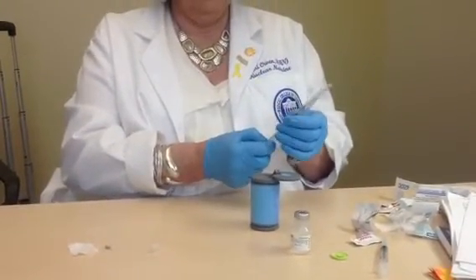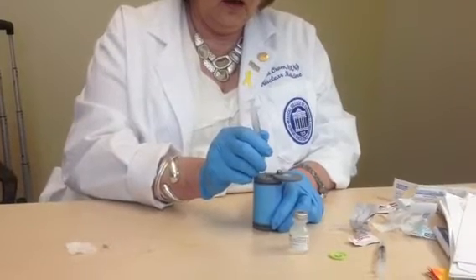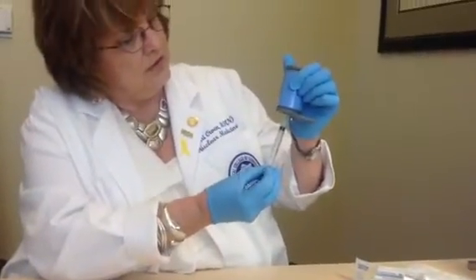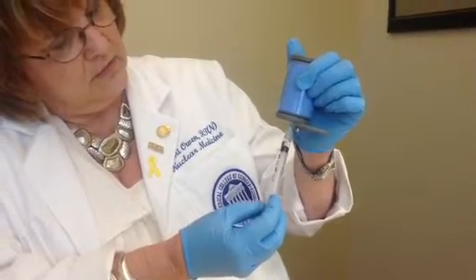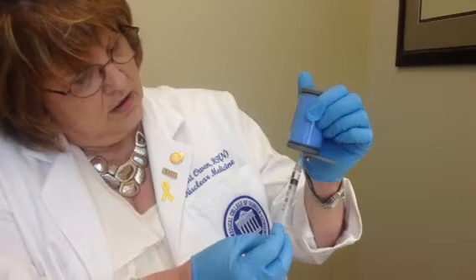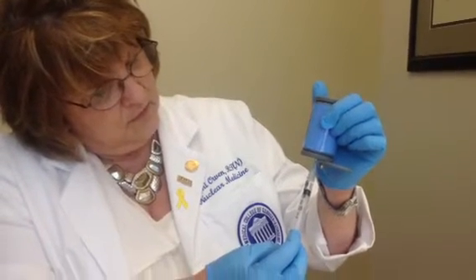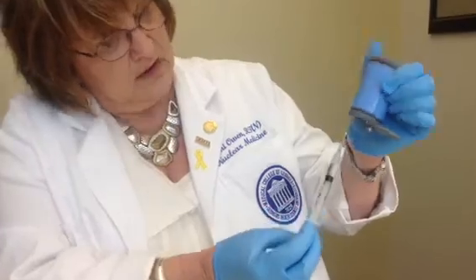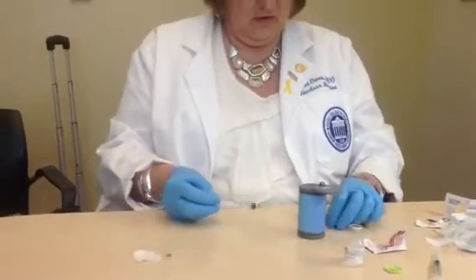Okay, again, I'm going to break the seal. It's difficult to see inside this vial, but I can actually see to draw it up, and I am drawing, and I am not fully, and I'm going to let it go back in a little bit, and I will draw some more. Let it cue up to make sure the bubble's gone. Pull out a little further. Remember, if you're not fully submerged in the fluid, you're not going to get a dose. Okay, and that's it. And I have my 1 cc dose there that's ready to be injected in the patient.